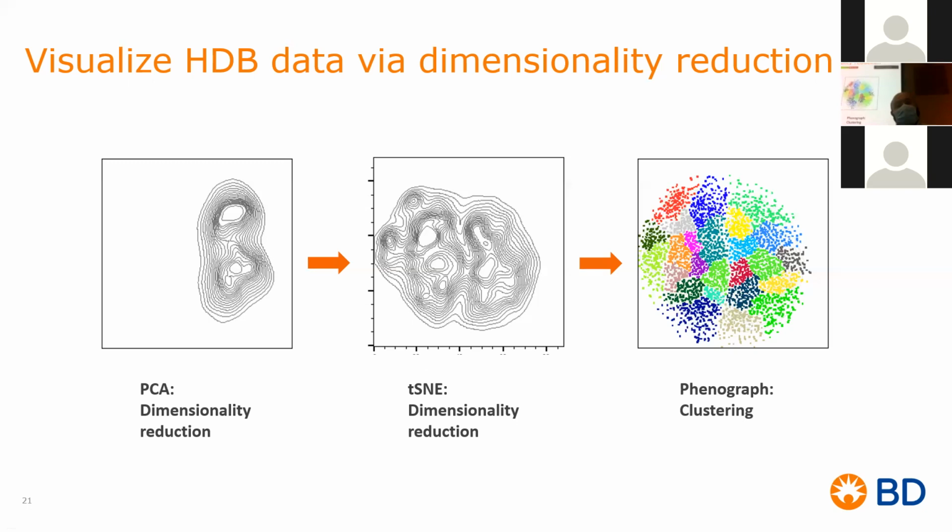And t-SNE, and again, I showed you earlier a different dimensionality reduction map, and that one was TriMap. Why did I do t-SNE now before I showed you TriMap? t-SNE is looking at the global structure. It's looking at the overall and total number of phenotypes present in an experiment. And that's what we get here afterwards, because t-SNE does not give you clusters. t-SNE gives you islands, okay? t-SNE is not a clustering algorithm. It is a dimensionality reduction algorithm.